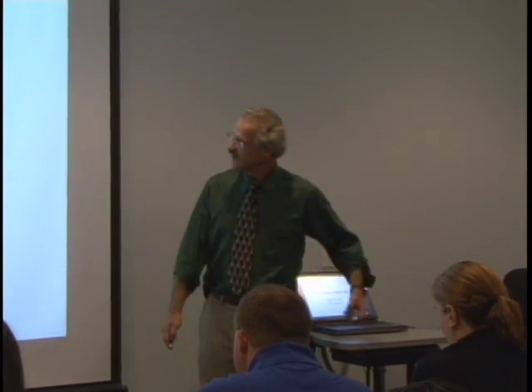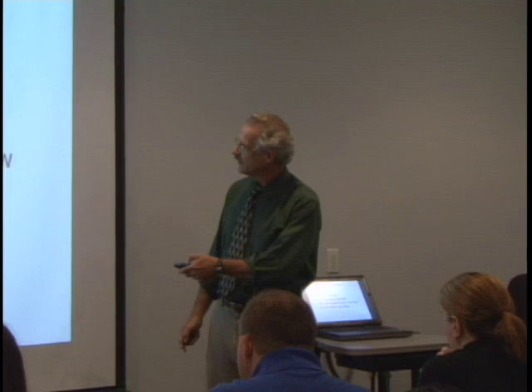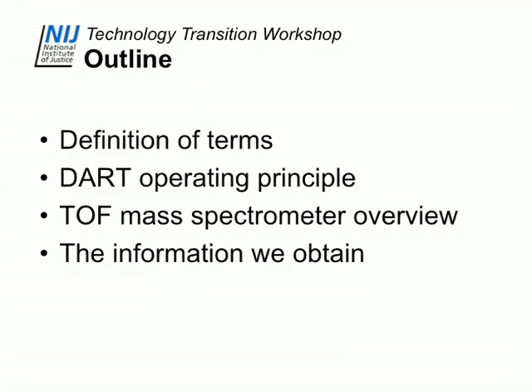So let's see. There we go. Here's the outline of what I want to talk about. Just start with a definition of terms, then review how DART works. We're going to start with the basics of how DART works, and then later I'll come back and talk about some of the subtle, less obvious things about how it works and how the harder samples are managed.